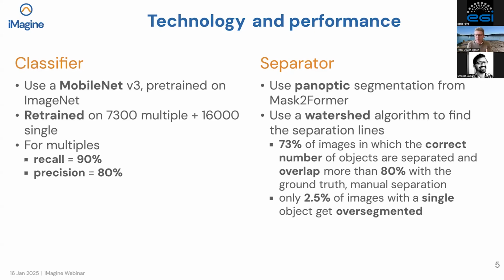So that's a deep learning approach to segmentation, which works intelligently to separate objects, but which does not work at the pixel level at the boundary of the object. And it's really important to have the pixel level masks so that what we do now is backward compatible to the way that ZooProcess has done it for the past, probably 10-something years.